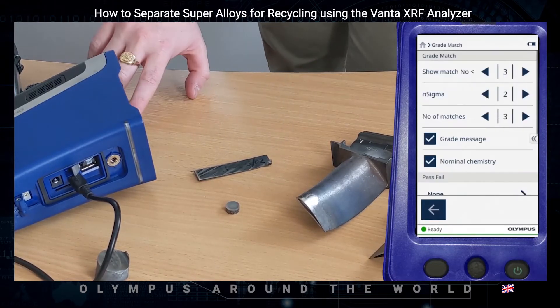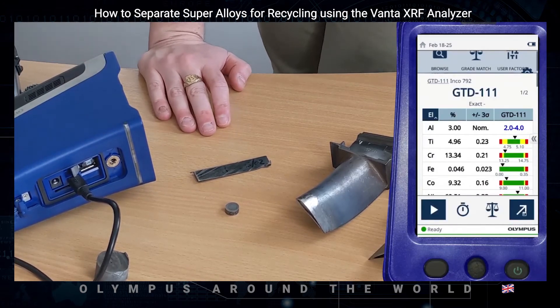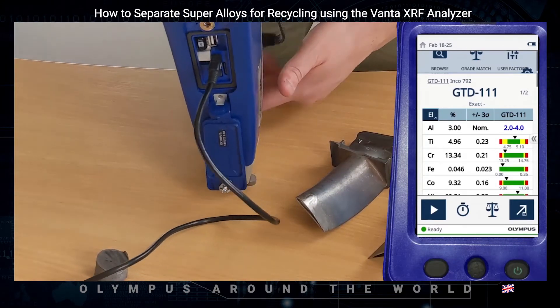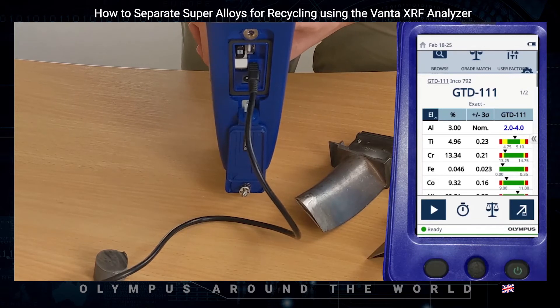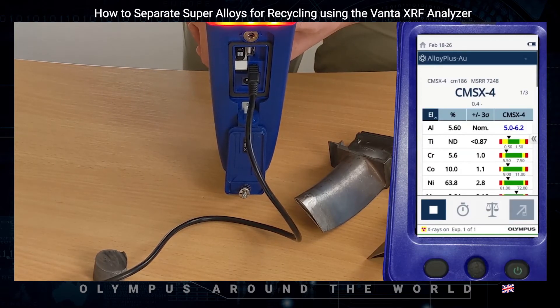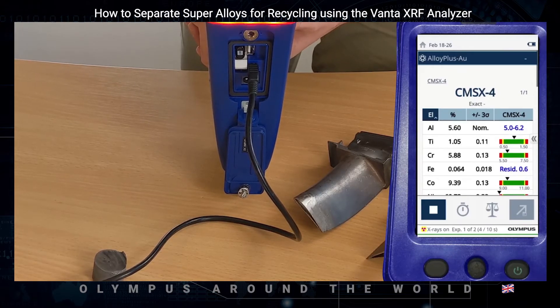Let's test these other samples and see whether we can get grade matches or whether surface prep needs some work. Now this smallest one causes some problems due to alignment, but as long as you get the sample central and hold the instrument still, we should still get a good result. And as you can see on screen: CMSX4.